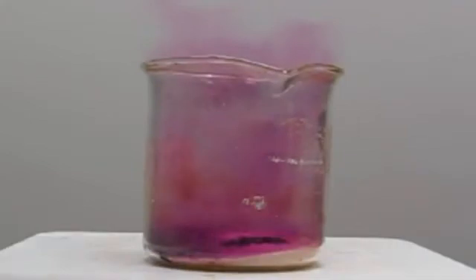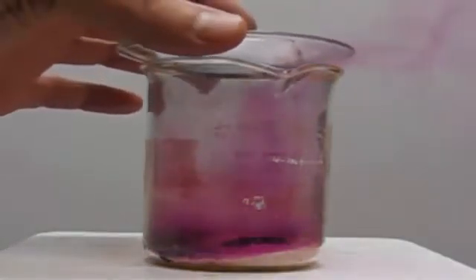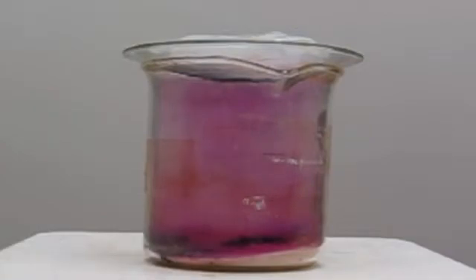We can actually capture that gas — right now it's escaping through the top of the beaker — but we can put a piece of glass on there, a watch glass, with ice on it. That's really cold and that's going to change the iodine gas back to a solid. It won't go through a liquid phase; it'll go directly from the gas to a solid, and that will stick on the bottom of the glass.